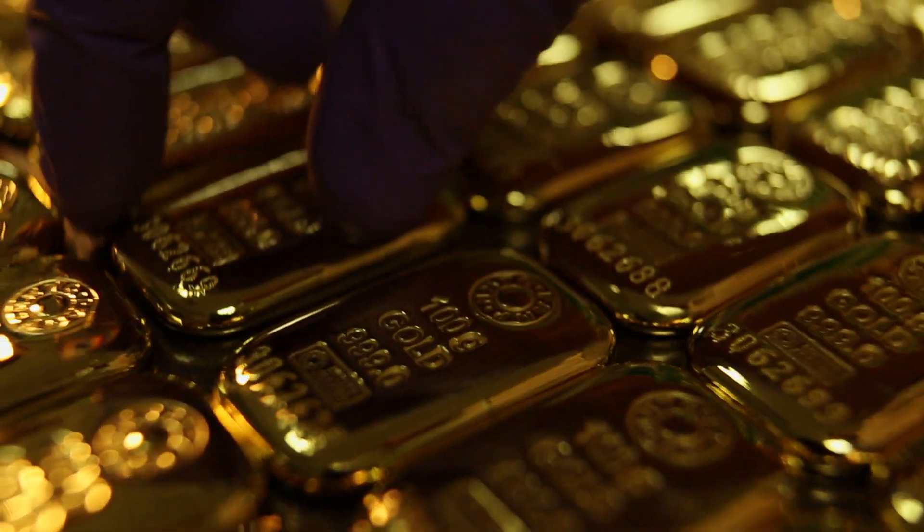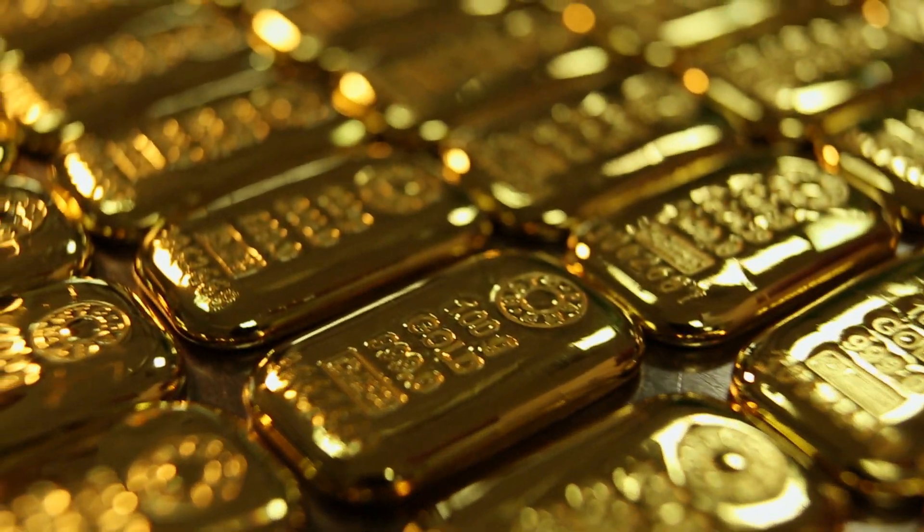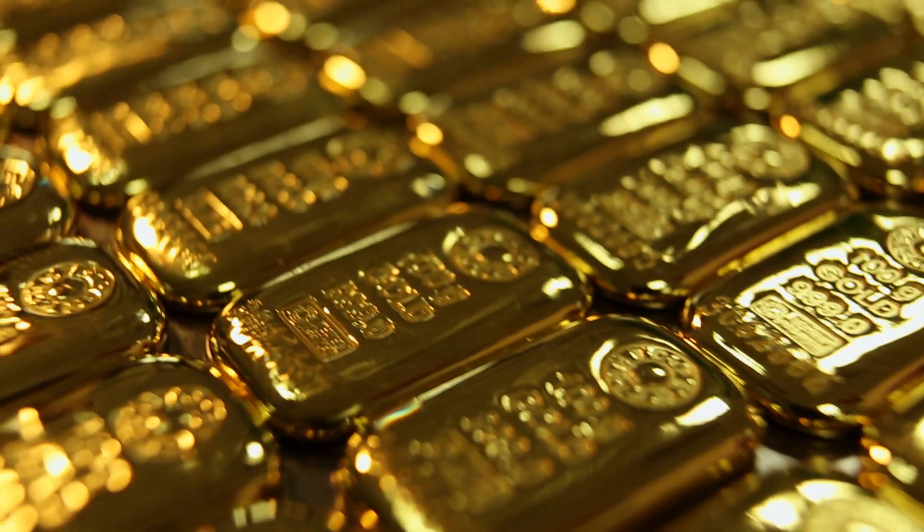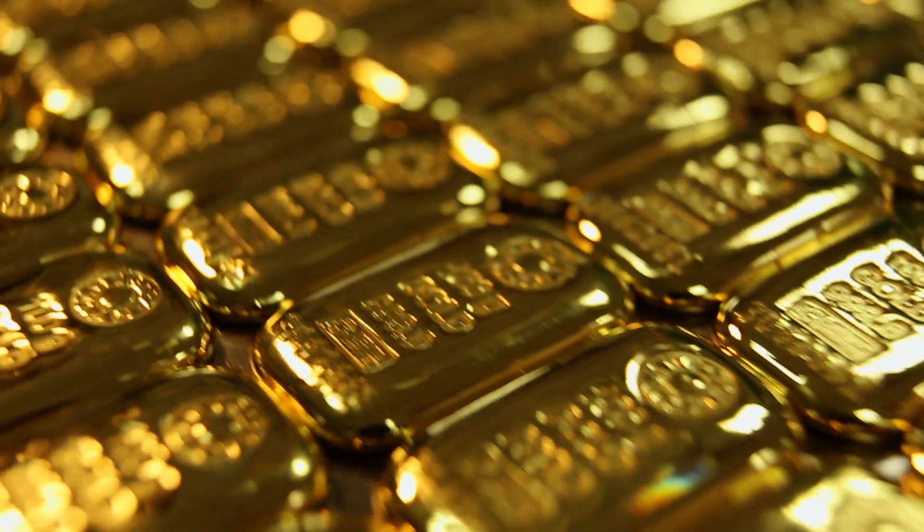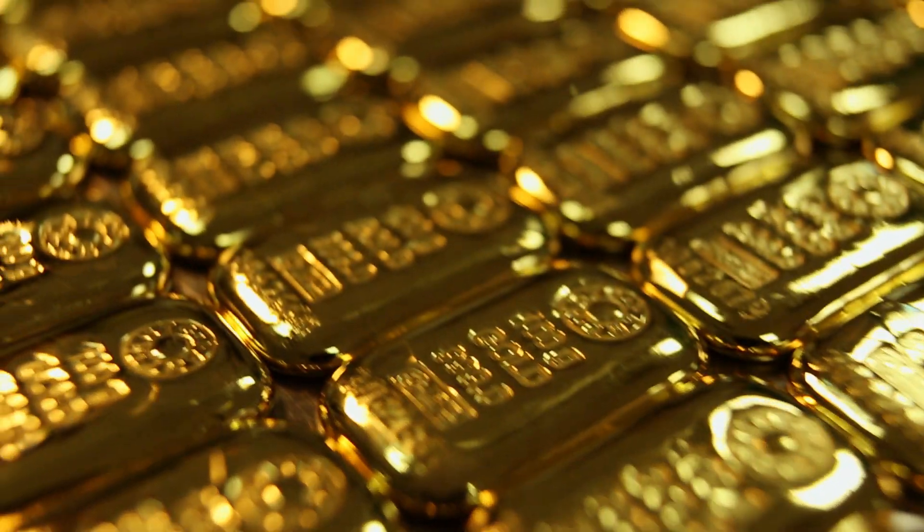Next time you marvel at your gold, remember that assaying has a big role to play in ascertaining its purity. Thanks to assaying, all that glitters is actually gold.